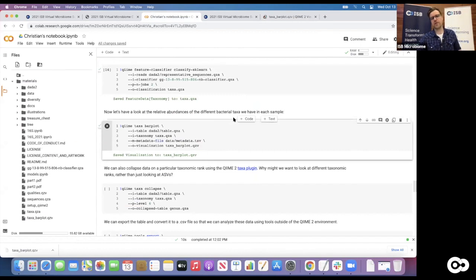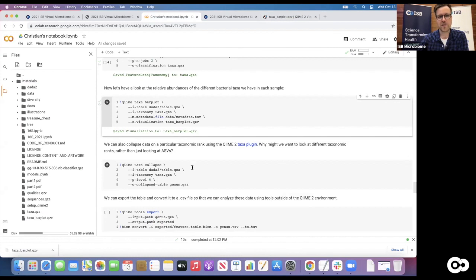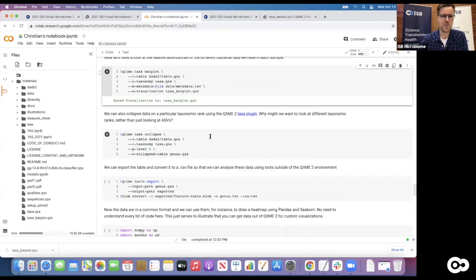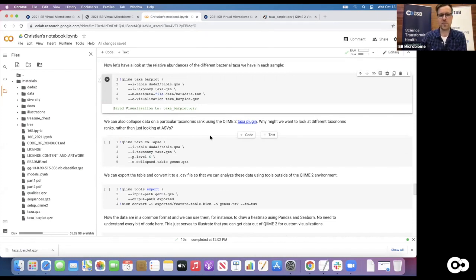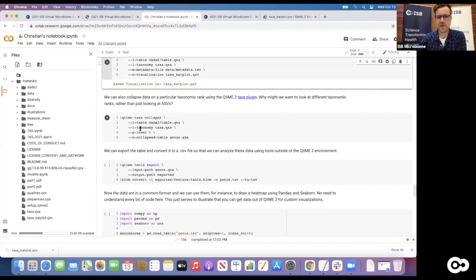Nice - so that's quite a bit of insight we've generated. We saw how the microbiota composition varies across environments, identified some environments with high alpha diversity, and saw clear taxonomic signatures for certain environments. Maybe let's do one quick example of how to actually pull out data from QIIME 2 for your own analysis. You saw that we always have to go from artifact to visualization to end up with something we can look at, but sometimes you might just be interested in getting the raw data. Let's do an example where I want that matrix of genus abundances across all samples and want to do a plot with my own Python code.